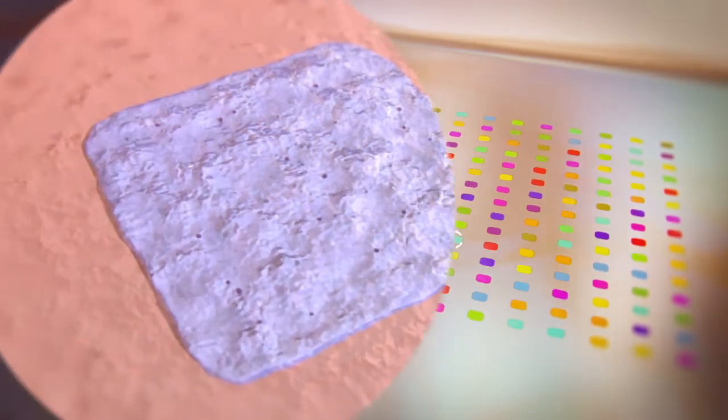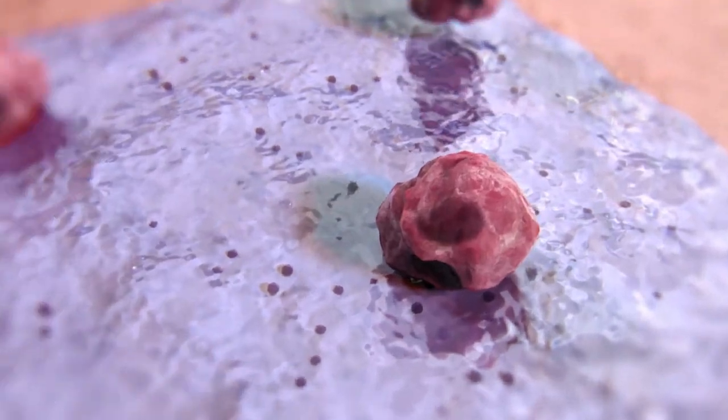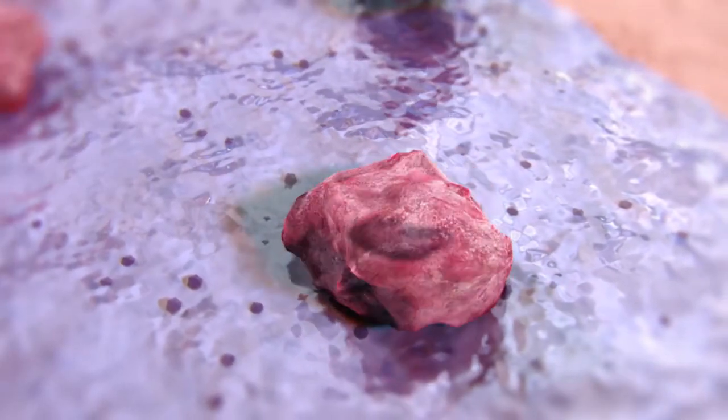The chip surface is covered by a lipid transfection reagent to promote uptake of the genetic material. Cells are seeded on the glass slide, adhere to the printed surface and cover the spots.